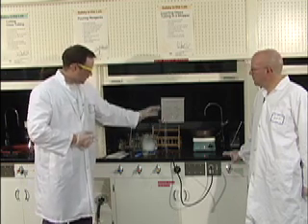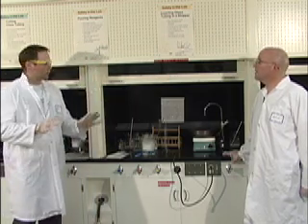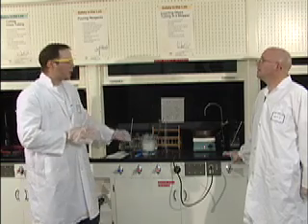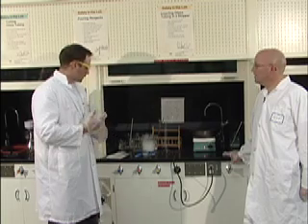Now, it's important at this stage not to stir. No stirring. Definitely no stirring. The reason why is because if you stir, the crystals aren't going to come out of solution, and we want the crystals to come out of solution.